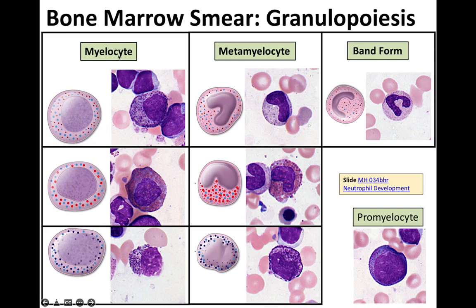When the myelocyte changes into a metamyelocyte, the nucleus begins to indent. So when the nucleus is indented, the myelocyte becomes a metamyelocyte. So we'll have neutrophilic, eosinophilic, and basophilic metamyelocyte. And in the neutrophilic lineage, we have an additional stage, which is known as the band stage or band form. The nucleus becomes C-shaped, and it has equal width throughout its length.